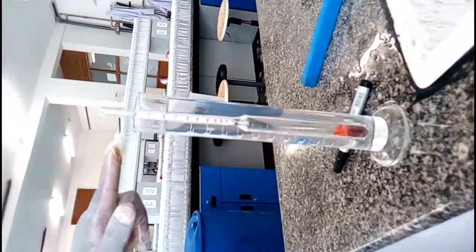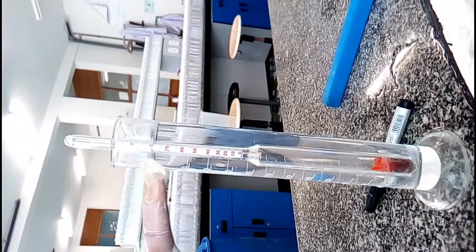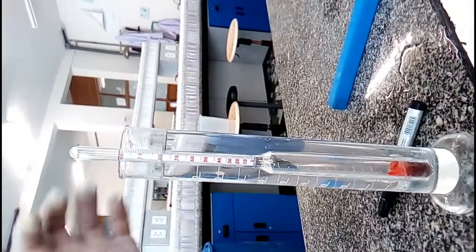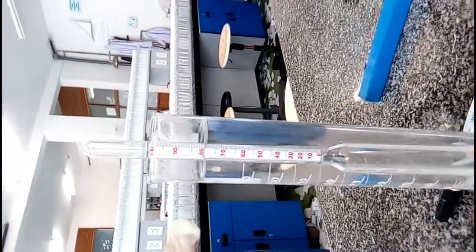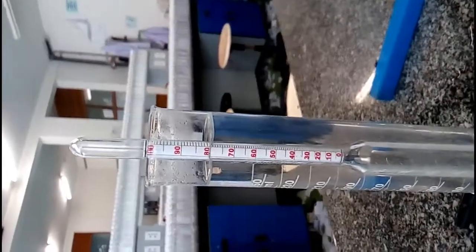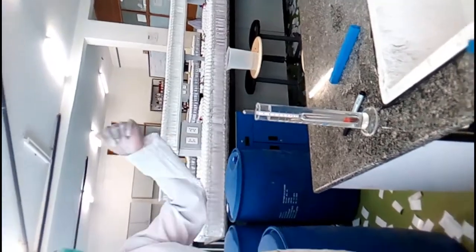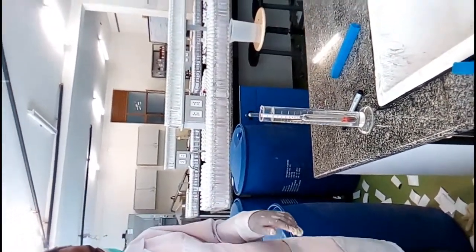As we said, our sanitizer contains 80% ethanol, so our reading shows, as you observe from nearest, almost 80. So that shows that our reading is exactly what we prepared, 80% ethanol prepared in our lab.